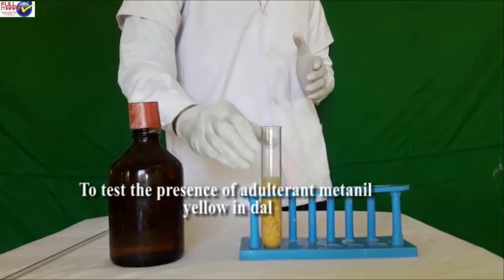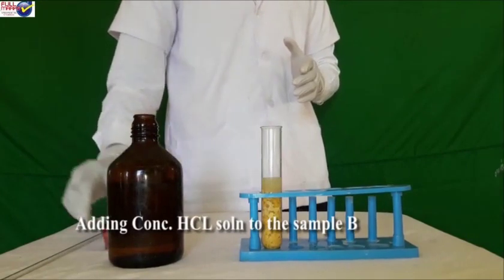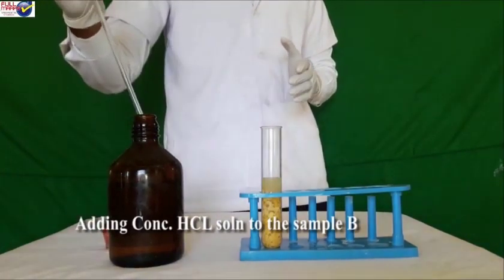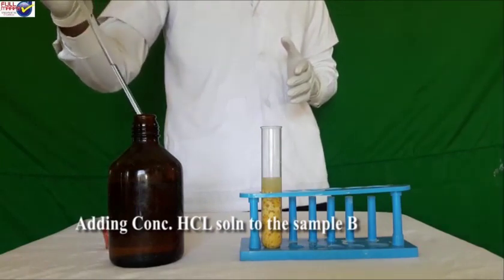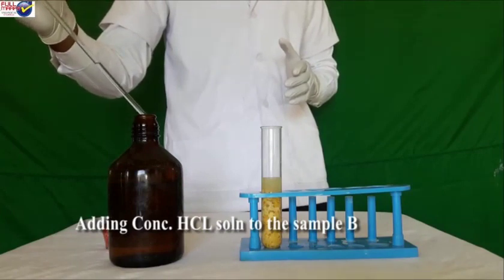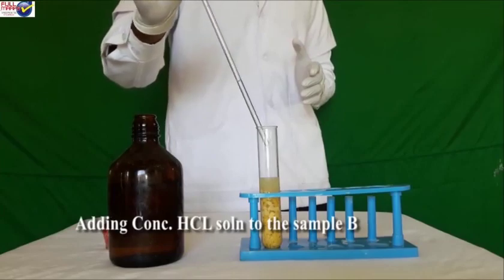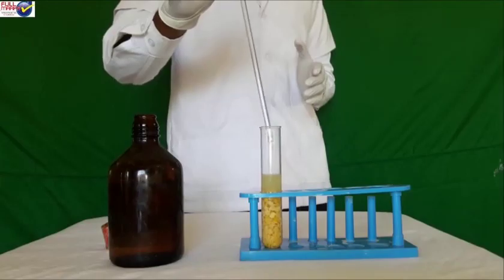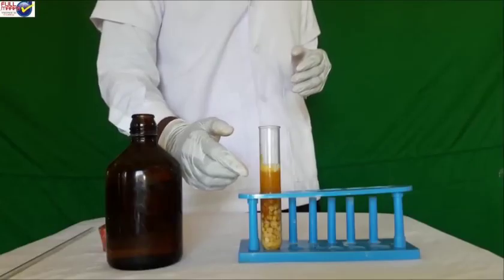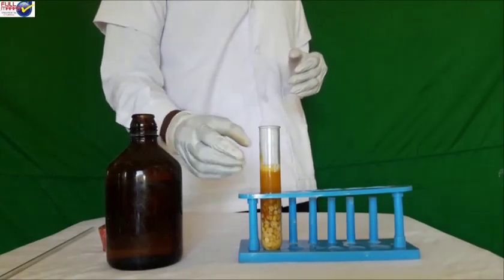To test the presence of the adulterant metanil yellow in dal. Procedure: take any dal in a test tube, add 2 to 3 ml of water and shake well. Add 2 to 3 drops of hydrochloric acid in the test tube. Shake the contents. Record your observation. Observation: a pink color solution appears in the test tube. Conclusion: the given sample of dal contains metanil yellow adulteration.